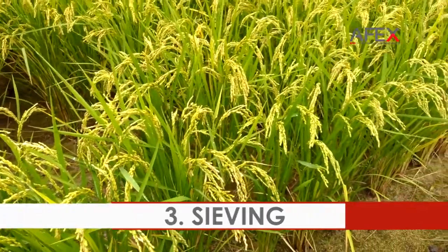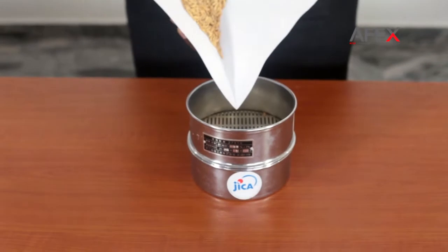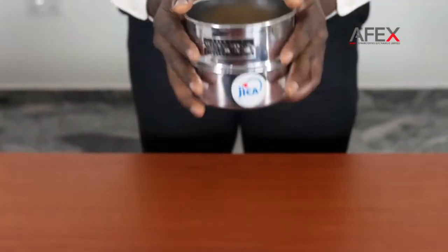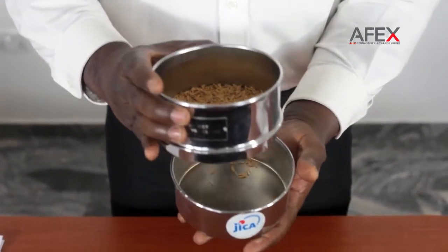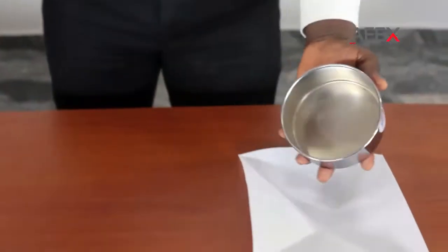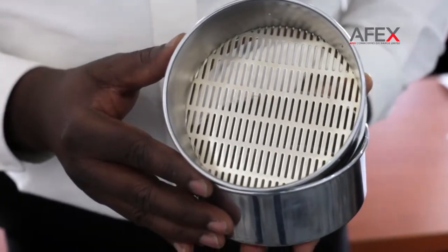Sieving. Sieve the 20-gram paddy sample for 30 seconds — for most popular varieties in Nigeria — using a 1.7 mm sieve. Anything that passes through the sieve is categorized as foreign matter. Be sure to shake along the paddy-shaped long openings.